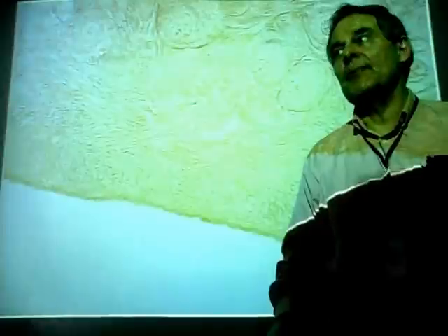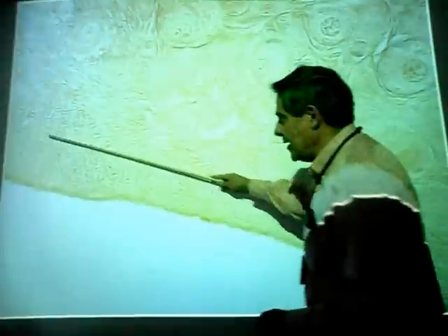The germinal epithelium, which unfortunately suggests something is developing there. It's not. It's called the germinal epithelium. Deep to that is connective tissue right in here, and that's the capsule, which again, like the capsule around the testes, is called the tunica albuginea. Then here, we have the developing follicles.